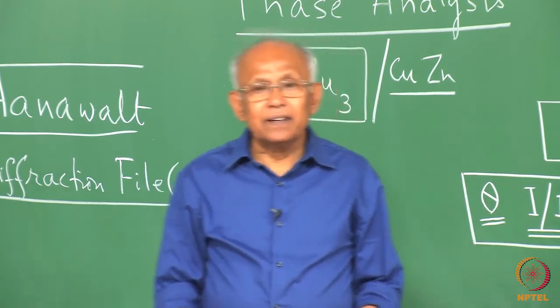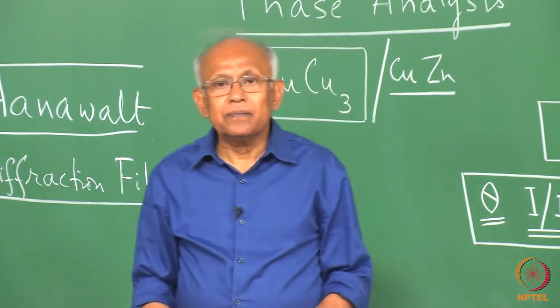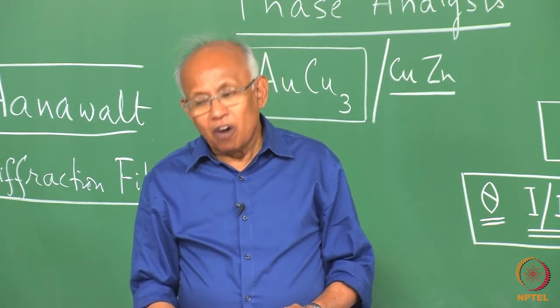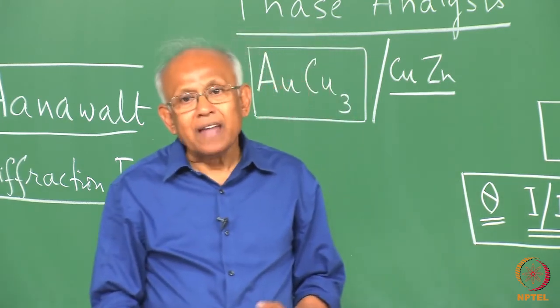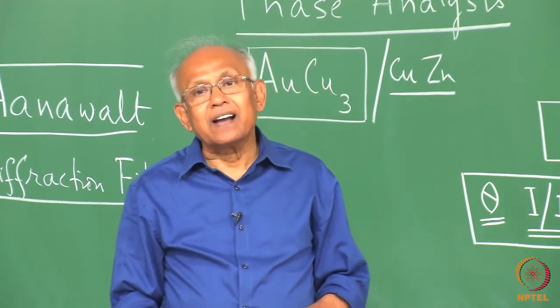We just take the diffraction pattern from the unknown material and try to compare the data for that material with the data provided in the many thousands of ASTM diffraction data cards.